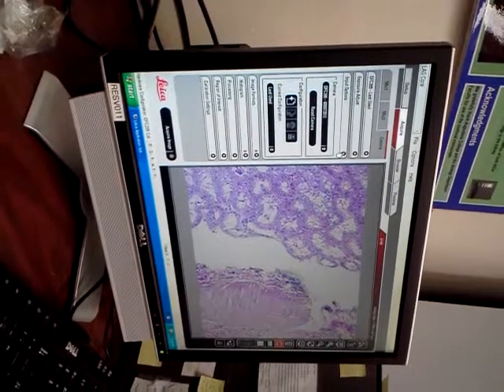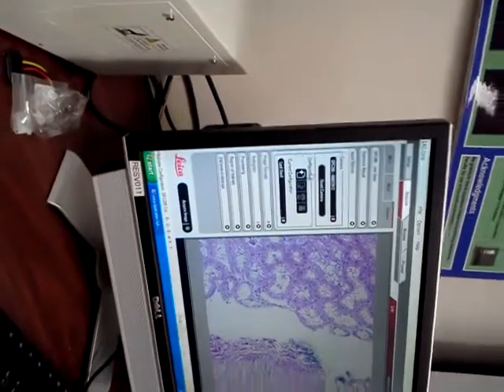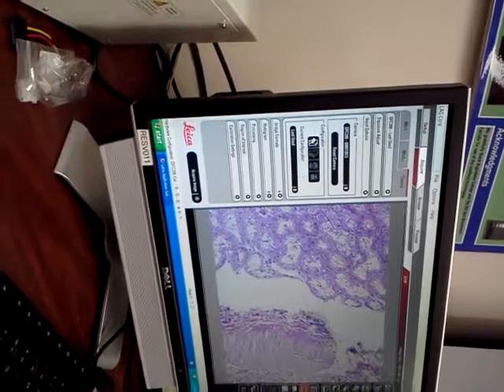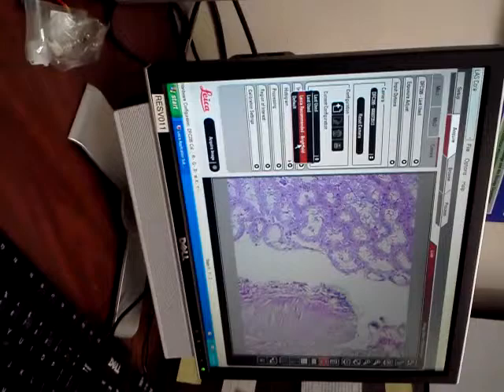The next one down is your input options. This just gives you this camera. This tells you what camera is connected right now. And this is very important. Very important. Your configuration tab. I did this already and I saved one. I did like it recommended for Brightfield.